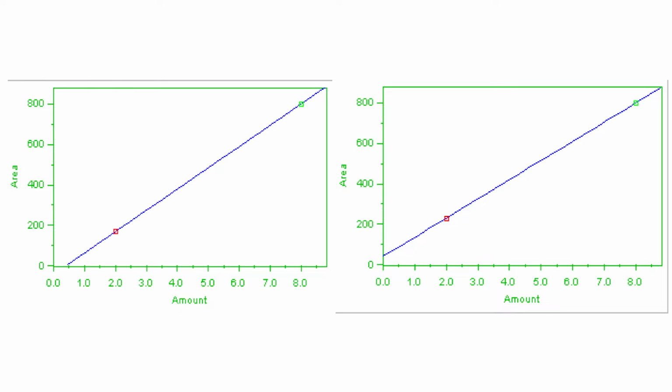To dispense with the assumption of proportionality, that is, that the calibration curve passes through the origin, there must be data points at more than one amount. If calibration is performed at several amounts across the range of interest, then any significant deviations from proportional response will be apparent. Replicate points at each amount are acceptable here, but are neither necessary nor, in themselves, sufficient.